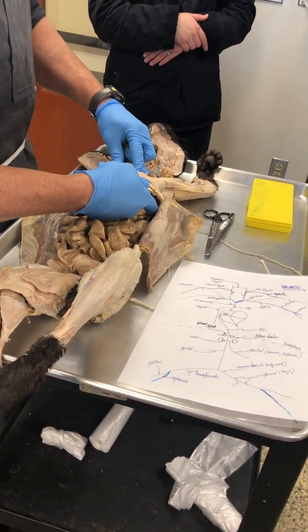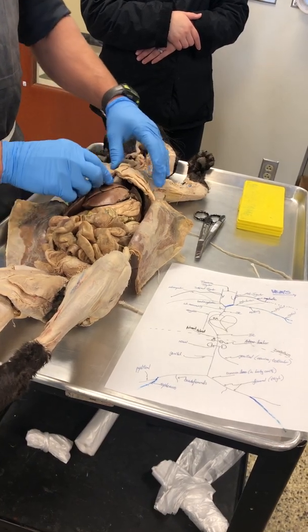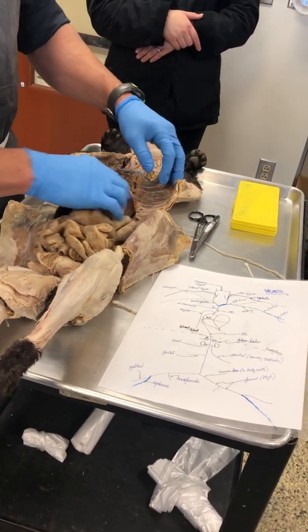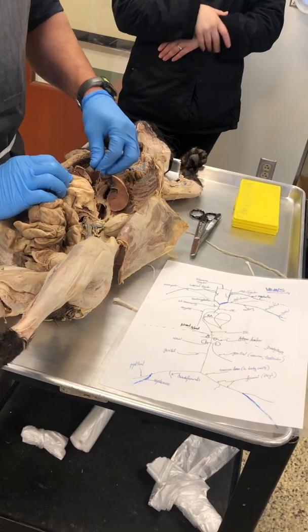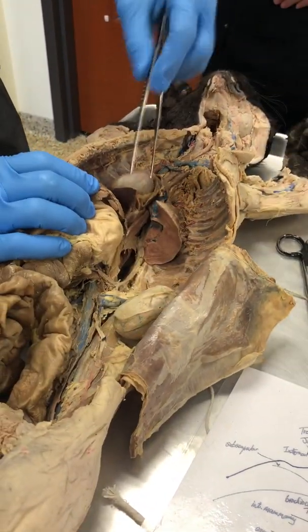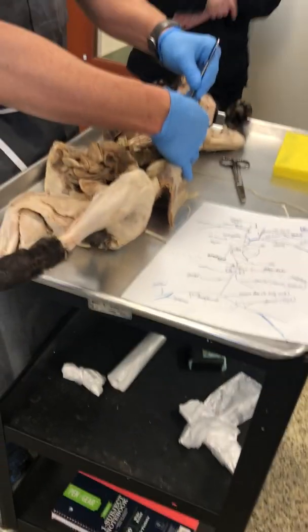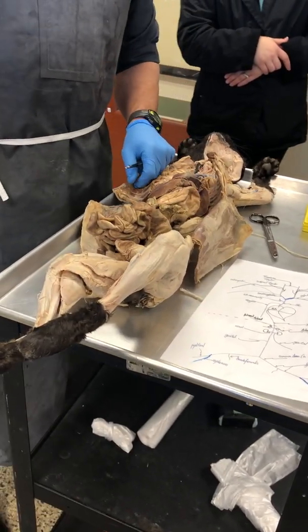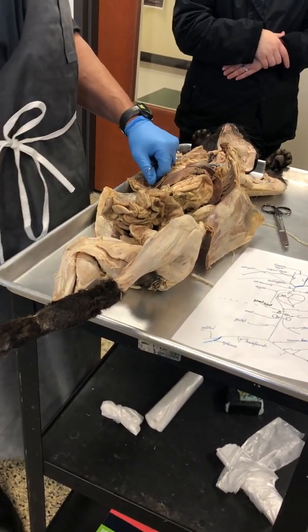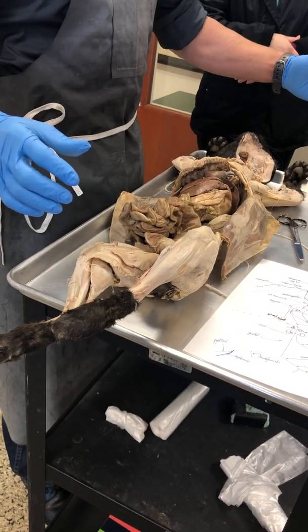Remember now, what structure separates the thoracic from the abdominopelvic cavity? The diaphragm. And there is the diaphragm right there. Right there's the diaphragm right there, which had been cut away here to open up that. So that is against that. Right? The ribs, folks, are somewhat of a letter C like that. So what's going to happen is that will just stay like that.